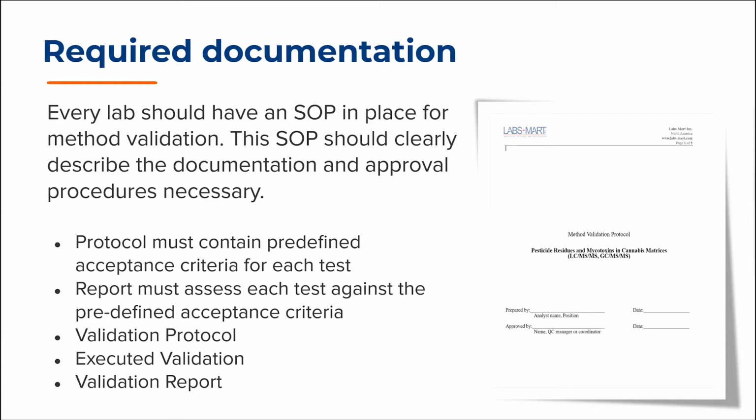First, a summary of the validation data indicating a pass-fail status. Second, a section for each parameter validated discussing the outcome of experiments and a detailed tabulation of the data collected during validation. Third, a section detailing any deviations from the protocol or any acceptance criteria failures. Finally, fourth, a section making a final assessment of the method's validation status.